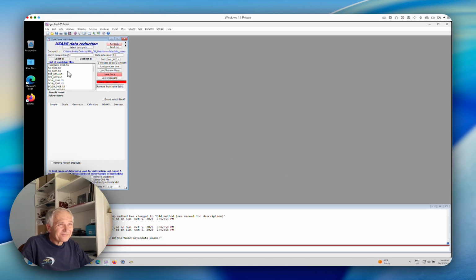Now, for every measurement in small angle scattering and even diffraction, you really should have a measurement of the background. In USAXS, you actually cannot reduce data unless you have the background. These samples were powder samples inside a tape. So a proper background measurement is the measurement of the tape. So we collected tape without any powder, call it a tape blank.